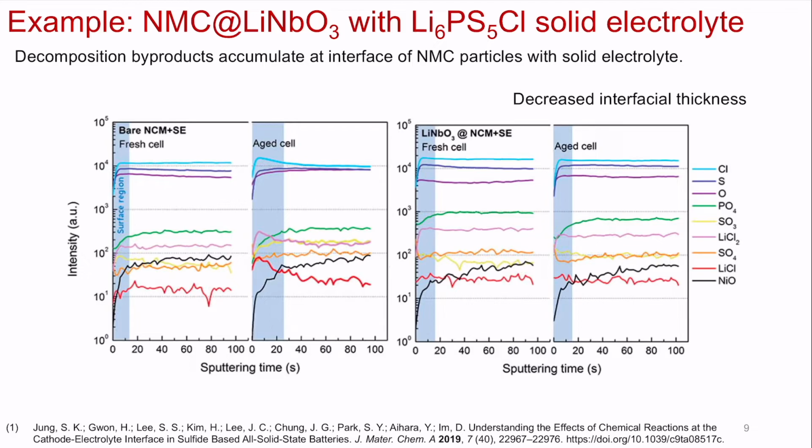Yes. For the bare sample, you have a thicker interfacial interphase thickness that has formed. That goes back to the more decomposition products that are formed without coating. Okay. So that's what that's telling you.